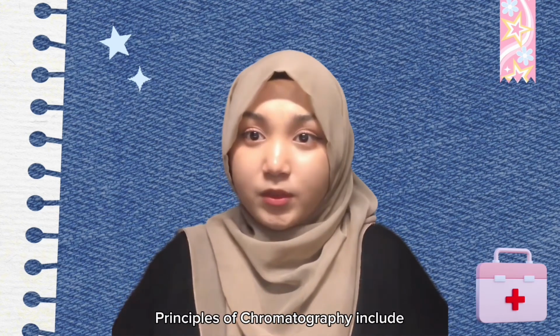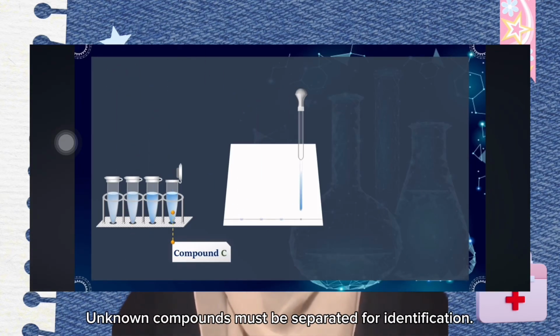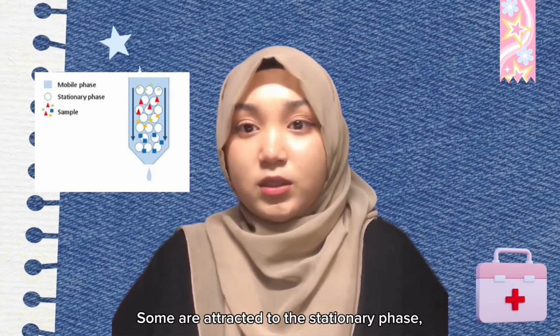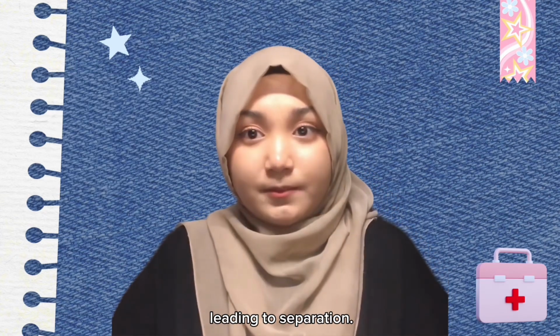Principles of chromatography include: mixtures contain multiple components. Unknown compounds must be separated for identification. Components vary in their intermolecular attractions, and some are attracted to the stationary phase, while others are more attracted to the mobile phase, leading to separation.